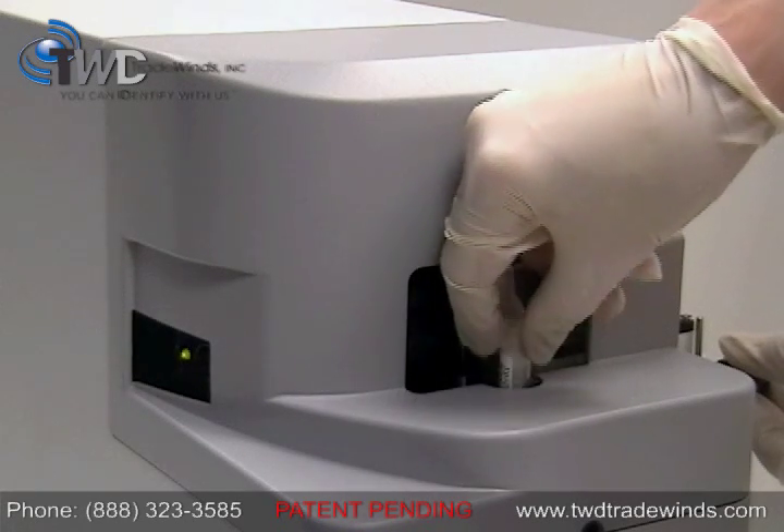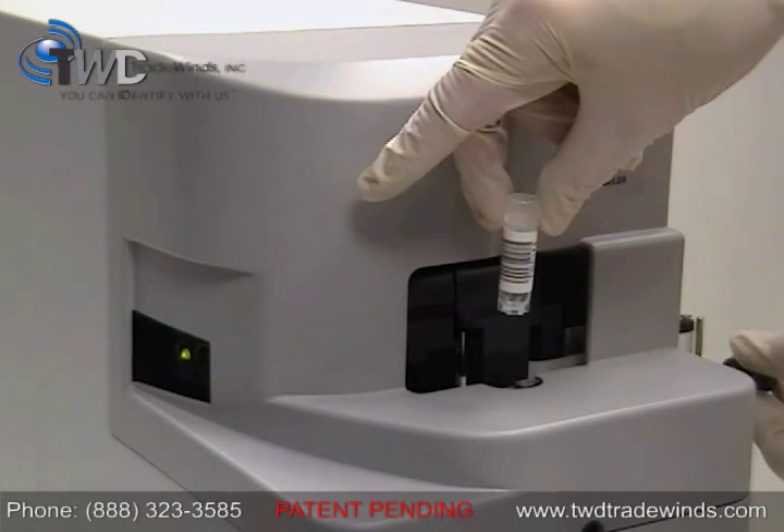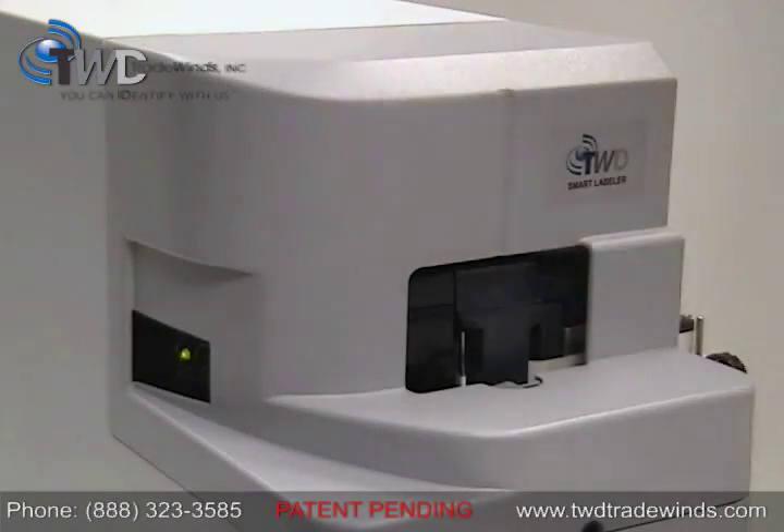This is the base module. In the Smart Labeler 2 model, a sensor is used to start the machine when the vial is loaded.